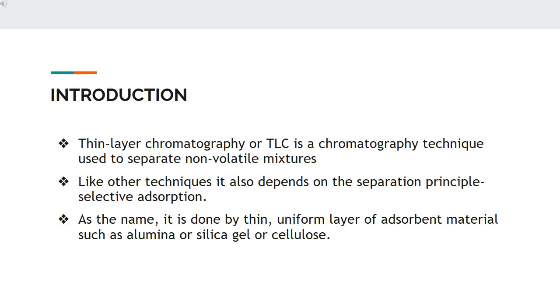Thin layer chromatography, or TLC, is a chromatography technique used to separate non-volatile mixtures. Like other techniques, it also depends on the separation principle of selective adsorption. As the name suggests, it is done with a thin, uniform layer of adsorbent material such as alumina, silica gel, or cellulose.